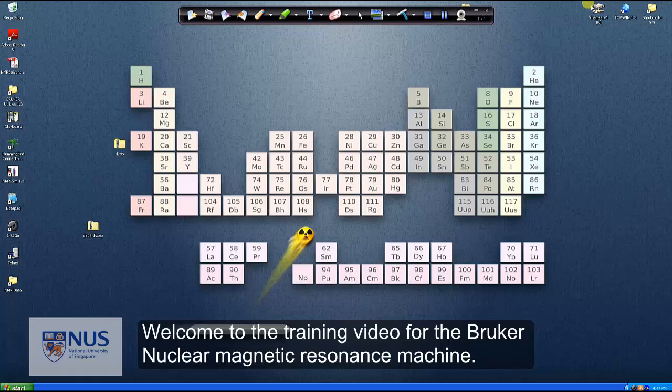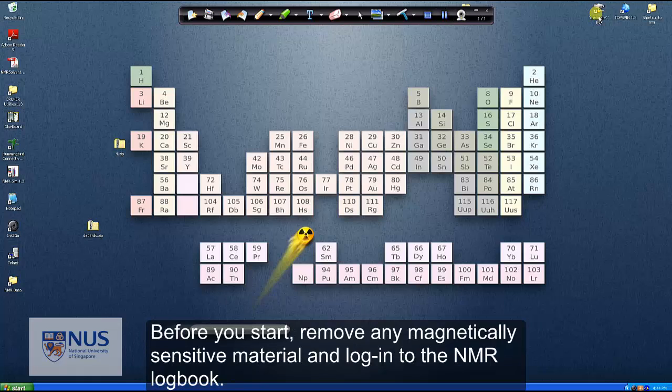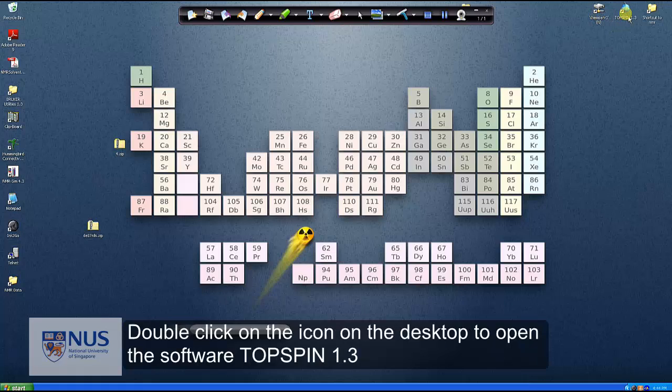Welcome to the training video for the Bruker Nuclear Magnetic Resonance Machine. Before you start, remove any magnetically sensitive material and log in to the NMR logbook.